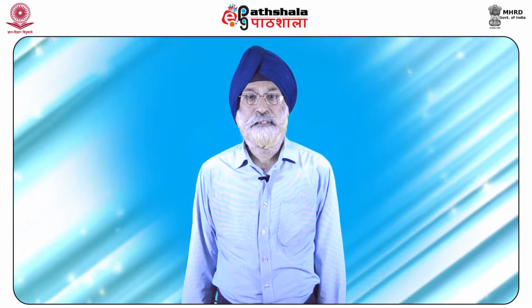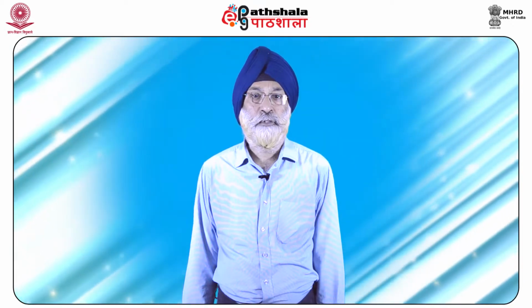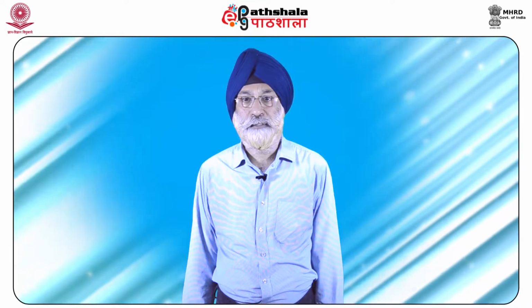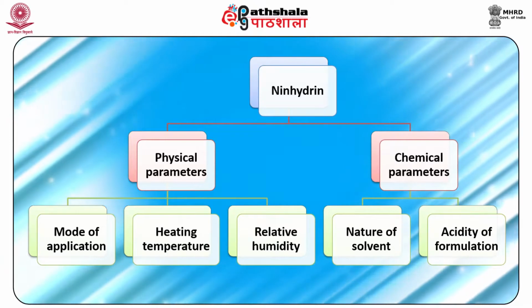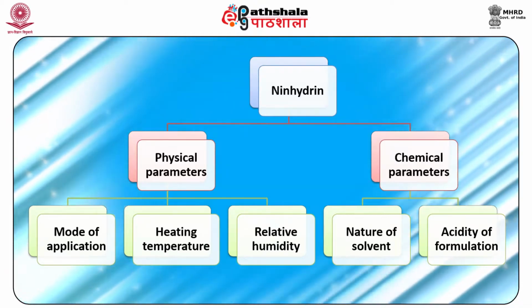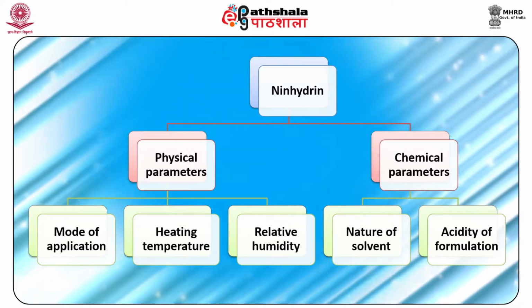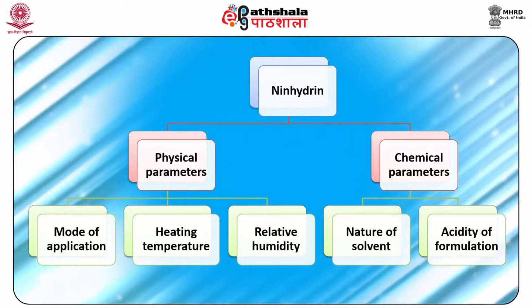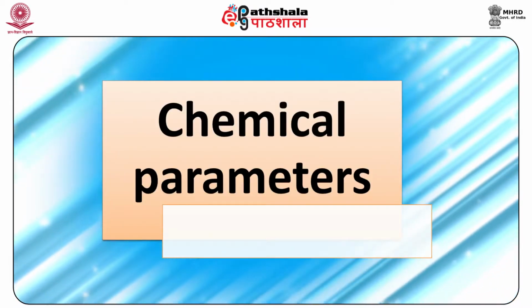During experimentation, there are several parameters that need to be adjusted for adequate and satisfactory development of latent fingerprints. These are the chemical parameters such as concentration of Ninhydrin solution, the nature of solvent and the acidity of the formulation, as well as physical parameters such as mode of application, heating temperature and relative humidity. First we take the chemical parameters.